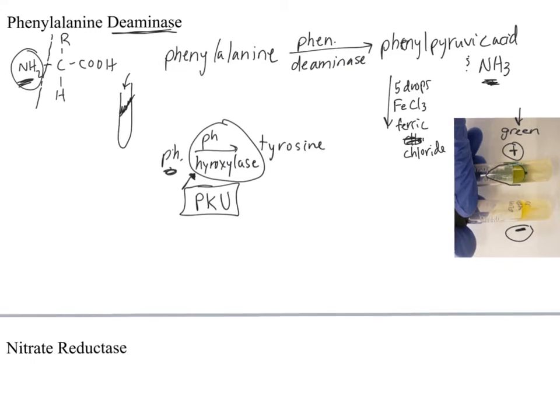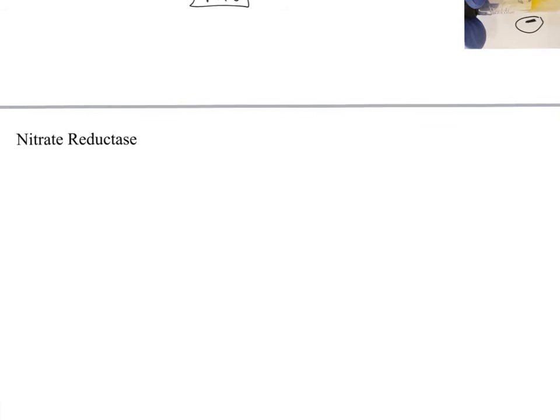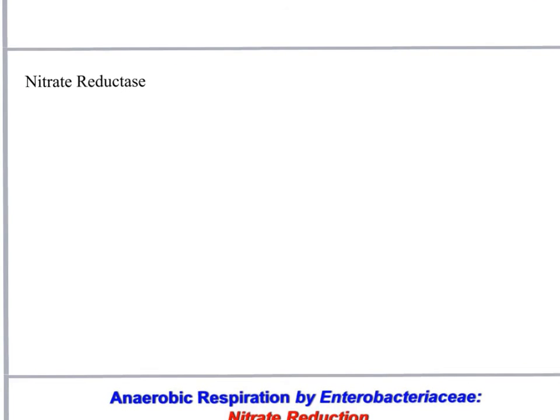All right, the other test that you're going to inoculate is to test for the enzyme nitrate reductase. And again, it's just one tube here, really easy on your lab day to inoculate it. Let's talk a little bit about the significance of this enzyme.